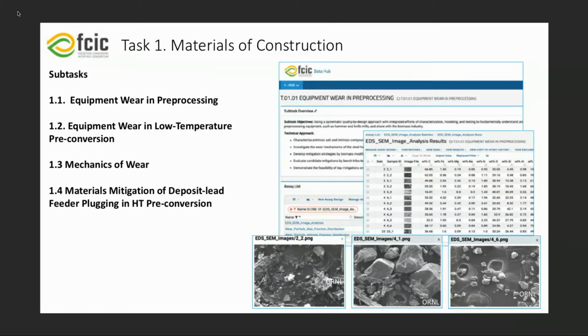So over here's a LabKey assay where they correlated. This was from Oak Ridge, and they have what is called energy dispersive spectroscopy, I think it is, or emission dispersive X-ray spectroscopy, coupled with scanning electron microscopy, where they can get the chemical composition, the elemental composition as they go along, scanning these. So this is in LabKey.